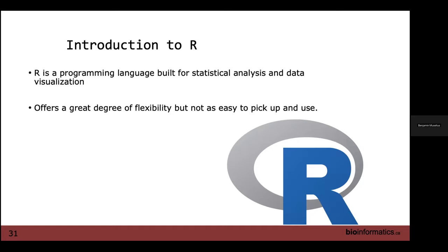But R is a very good tool for visualizing data. What R gives us is a platform to basically do whatever we want. A lot of pre-made data analysis platforms, your Perseus, Proteome Discoverer, DIA-NN, well, not as much, DIA-NN uses R, Spectronaut, things like that. They have a certain array of plots that they can make, but if you're asking certain questions or want to display data in a certain way, that may not be sufficient. So R is a very, very good tool.